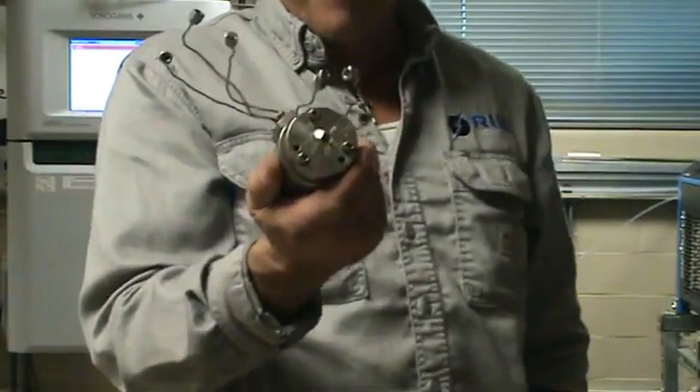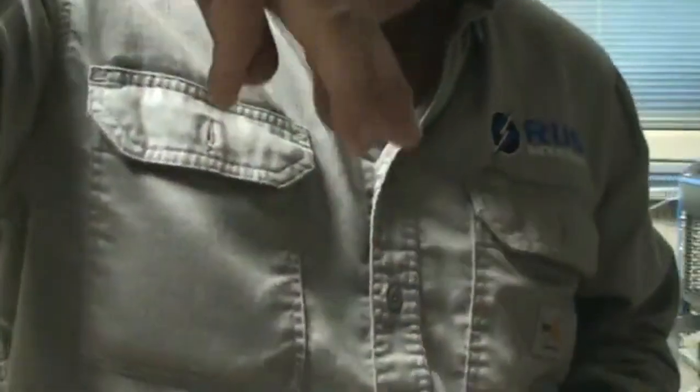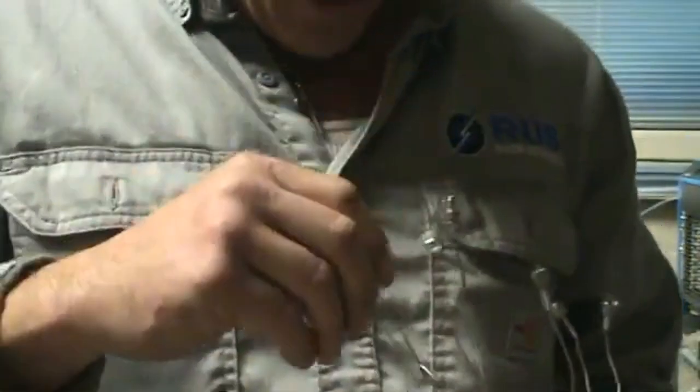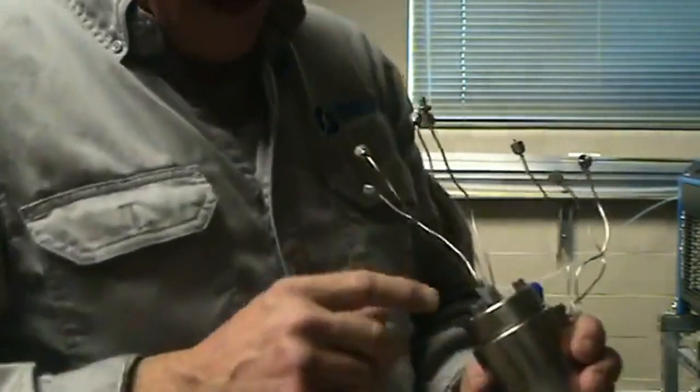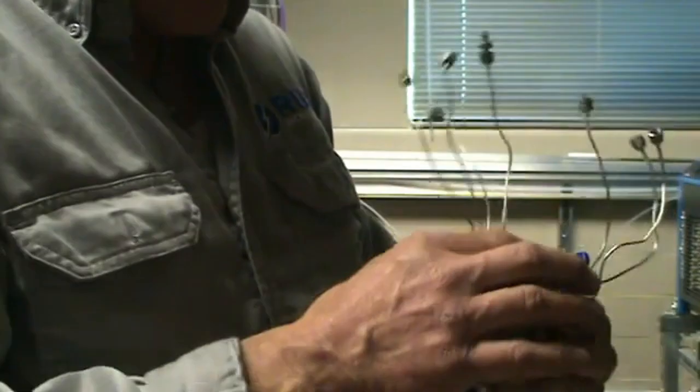Valco. Old style, Model 11s. Internally there's a cushion disc. It slams pins down in between, and that's what blocks flow or allows flow to go. This one has an internal cut already for a sample size.